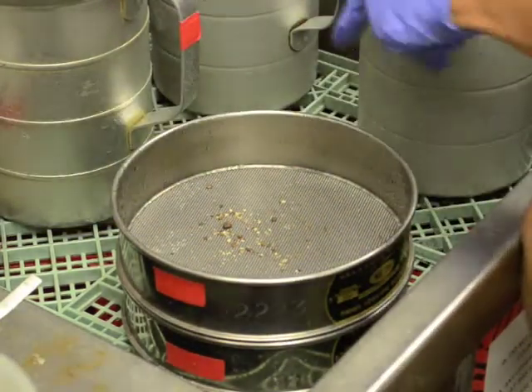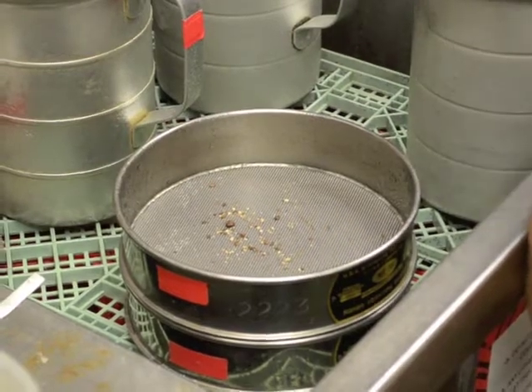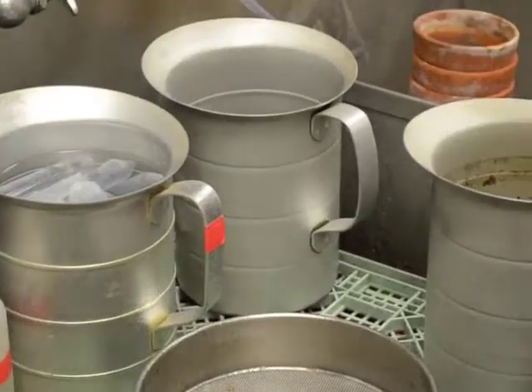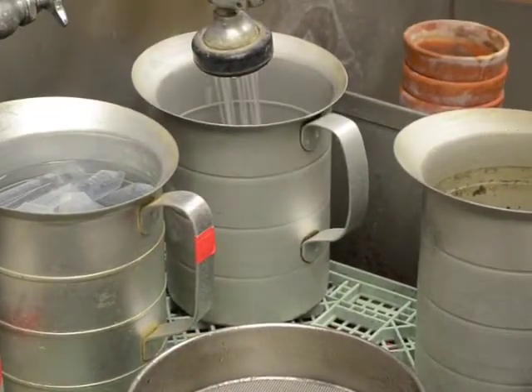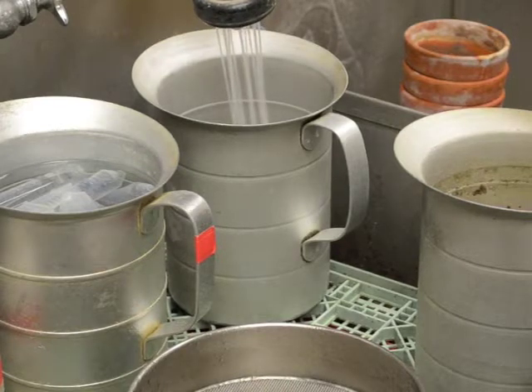After blasting the roots, take a 100cc aliquot of the soil that the roots came from and place directly into another pitcher. Blast the soil with a forceful stream of water and pour immediately onto the top sieve.